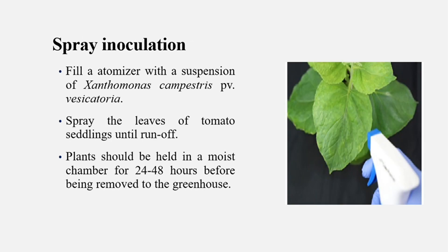The fourth is spray inoculation. We use an atomizer, fill it with the pathogen suspension, and spray it on the tomato seedling until run-off happens. Then we keep the plant in a moisture chamber for 24 to 48 hours.